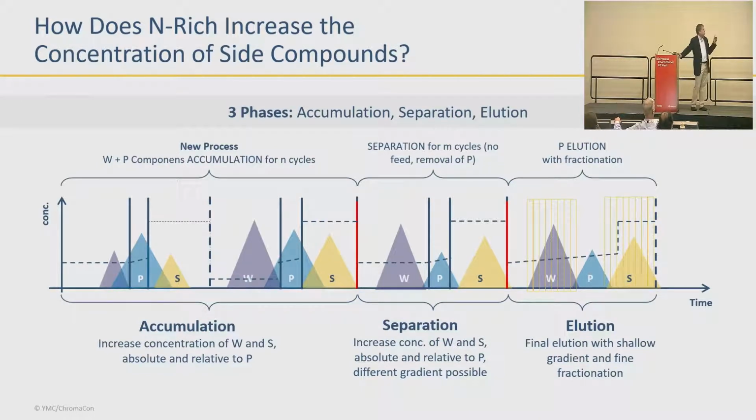All right, so that was if you were looking for just one target. We were really just looking for that middle peak. Let's say you wanted to know a whole bunch of things. You wanted to know all the impurities in the early and all the impurities in the late. So what you're really trying to do is get rid of the big peak, the big one in the middle that's overlapping everything else.